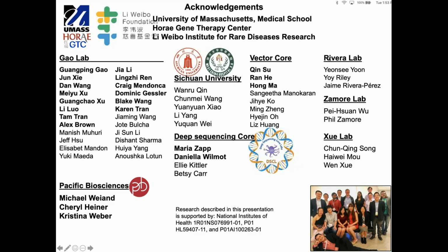We do see a large degree of these truncation events attributed to sequences such as the poly-A sequence, but those are not very strong factors in generating truncation events, such as those that I showed here in this presentation, like short hairpin sequences and siRNA cassette designs. Those are really the ones that give you the biggest problem.